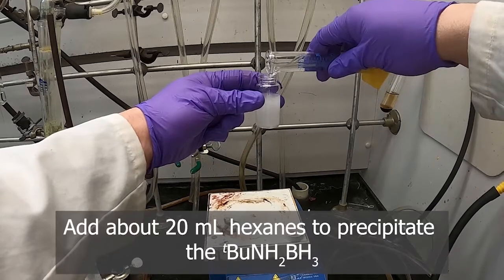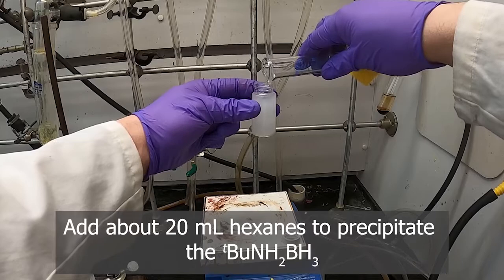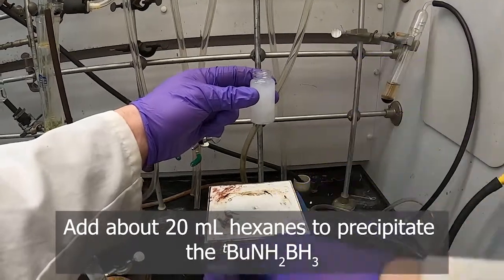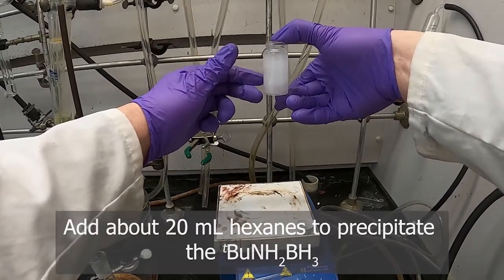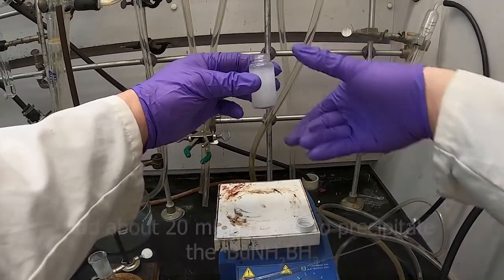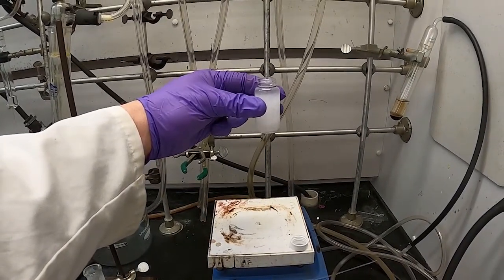And it gets nice and cloudy. So, didn't quite get it all, maybe we can. Yeah, pretty close. Okay. So there we go. You can see we got precipitate forming there. That'll be our product that we'll collect. So we'll get set up for filtration. We can collect our product here.